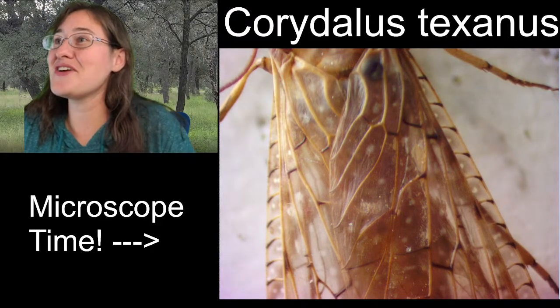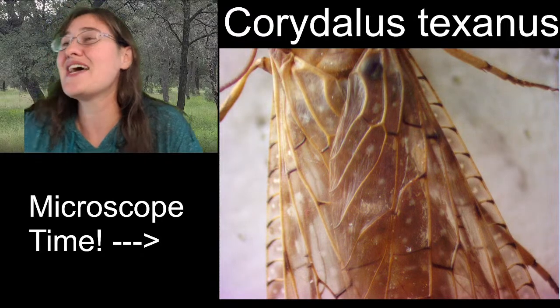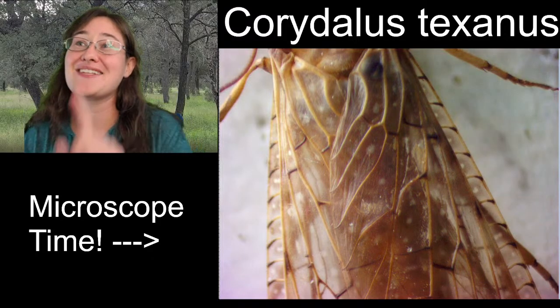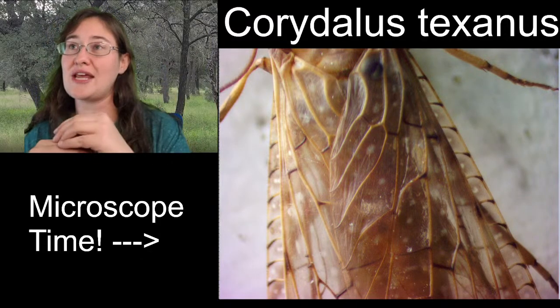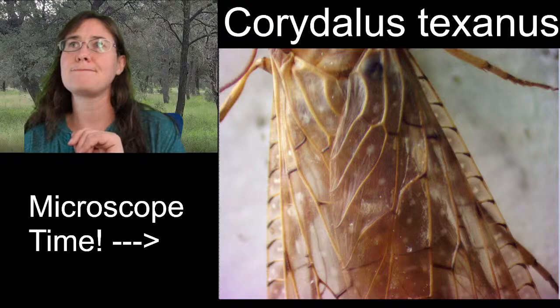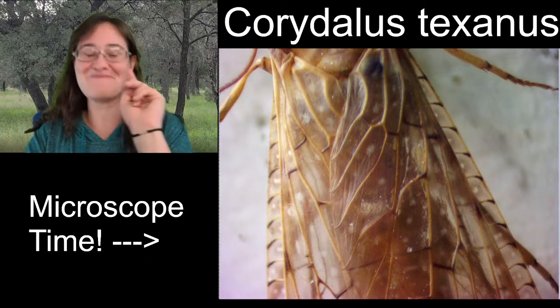Yeah, there are white spots in every single one of the cells. That's one of our characteristics for Dobsonflies, if you're looking at it. Because, all right, so I mentioned that Dobsonflies have a filiform or a straight antenna, and that fish flies have a feathery antenna.